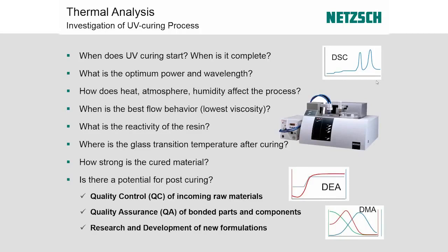But we'll start off by asking a couple questions. These are what most people come to us and ask when they say, I have a UV curable, I need to know, when does it start? When does this cure start? What wavelength of light do I need to use to cause this reaction to occur? How much heat does it take? What is the reactivity of this material? What's the glass transition after it's cured? All kinds of different questions that you can answer with these three techniques.